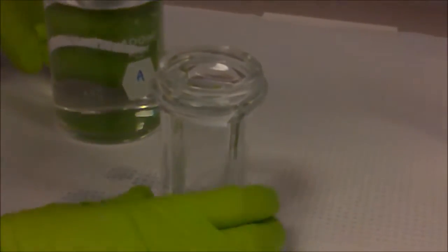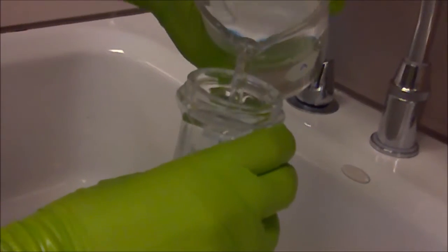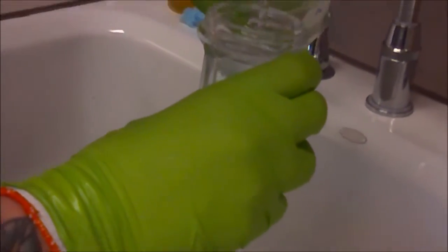Step 3: we're going to remove the slide from the periodic acid and we're going to do three washes with DI water — one, two, and three.